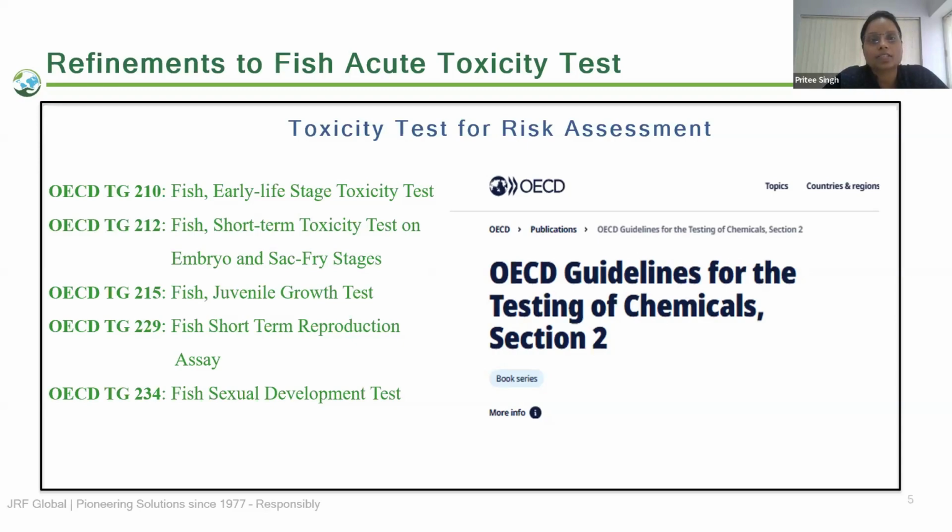So here the early life stages of fish are exposed to different concentrations of test chemical. Most probably the exposure is within 2.5 hours of post fertilization. So on the basis of the result of this toxicity test, the lethal and sublethal effects are calculated, and EC50 value is also calculated. EC10, 20 and 50 values are calculated along with NOEC and LOEC values. So the data collected from this guideline will be important for assessing the chronic toxicity of a chemical.